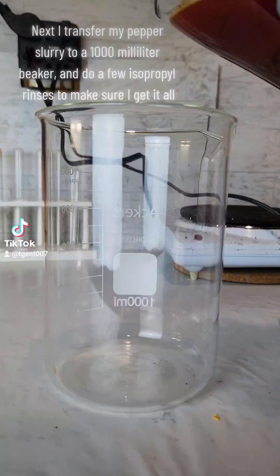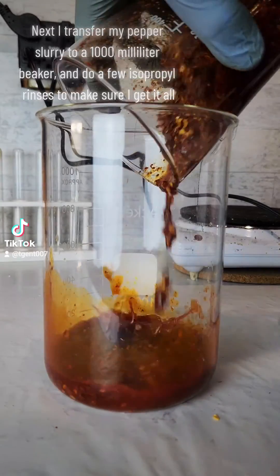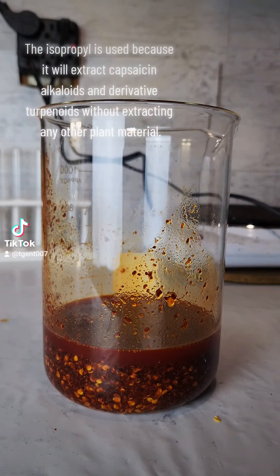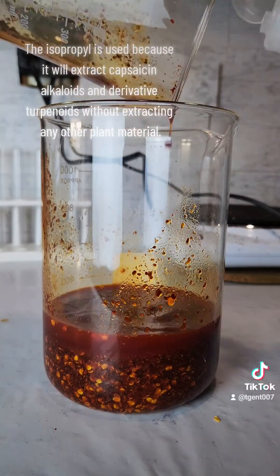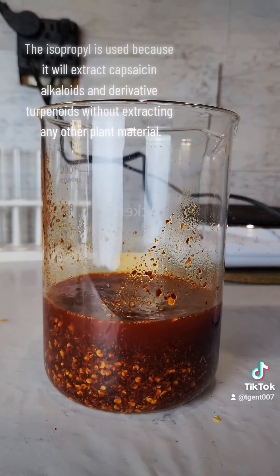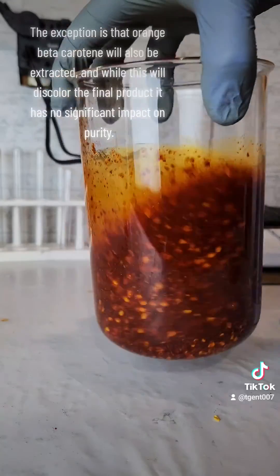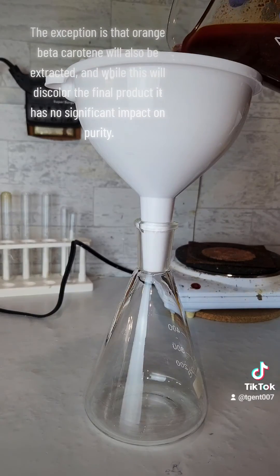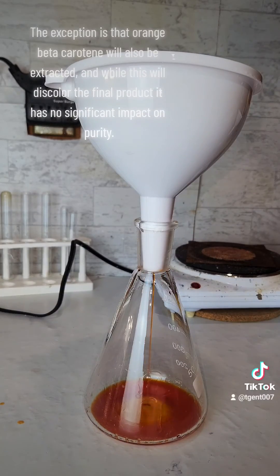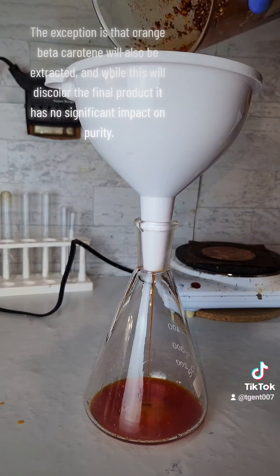Next I transfer my pepper slurry to a 1000 milliliter beaker and do a few isopropyl rinses to make sure I get it all. The isopropyl is used because it will extract capsaicin alkaloids and derivative terpenoids without extracting any other plant material. The exception is that orange beta carotene will also be extracted, and while this will discolor the final product it has no significant impact on purity.